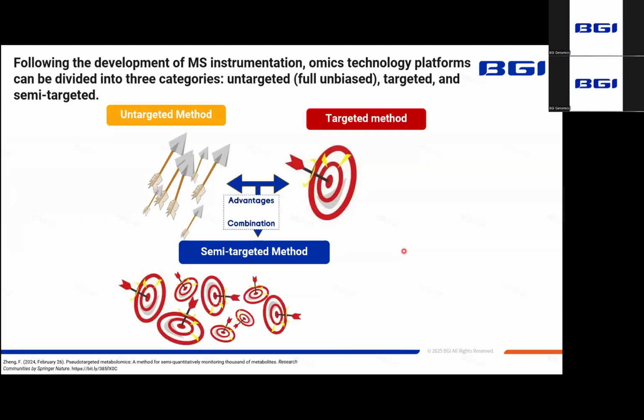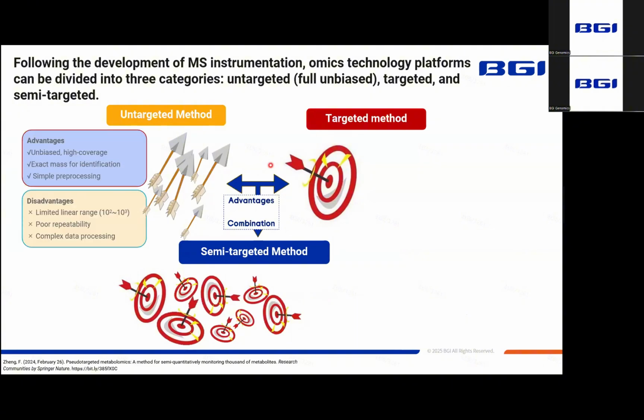Let's discuss the strategies: untargeted, semi-targeted, and targeted. Untargeted metabolomics is an unbiased survey capturing thousands of metabolites, ideal for discovering unexpected biochemical shifts. Its strength is broad coverage. Its challenge lies in complex data processing. Proper LC column selection and data-dependent acquisition mode scanning are key for success.